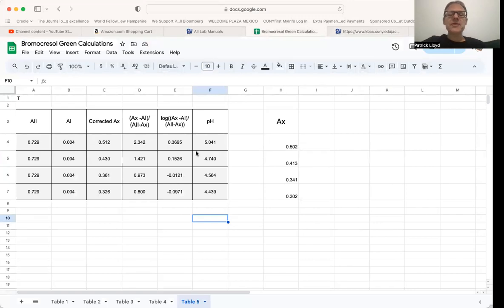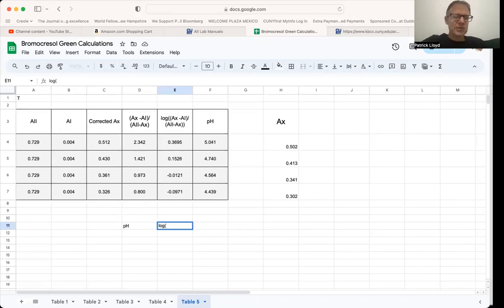We're going to do a graph. Now, the pH is going to be on the x-axis. So I'm going to put the pH over here, and then I'm going to put the log of the absorbance. I'll just write here, as a shorthand notation, the log of the absorbance, okay? But the absorbance we're talking about is actually this ratio here. So I'm just using that as an identifier. So equal sign, this one.